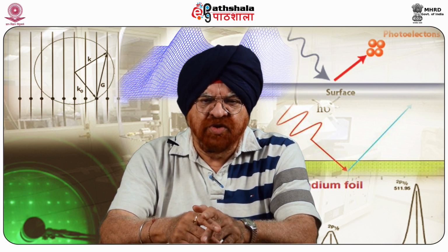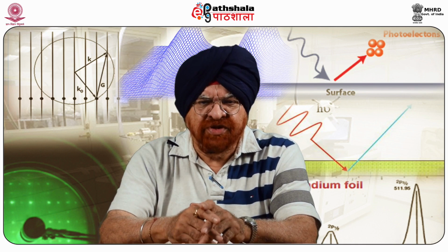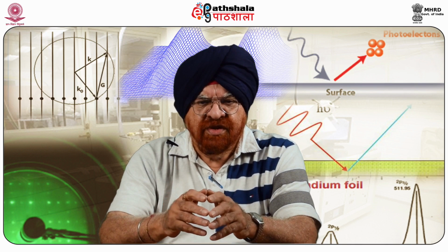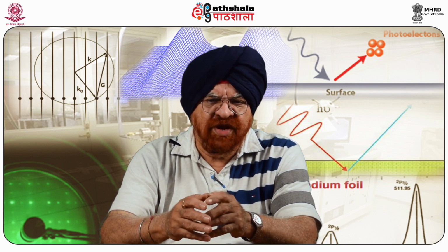Detection limits for most of the elements are in the parts per thousand range. That means 1000 ppm, parts per thousand range, as I said. Detection limits of parts per million are possible, but require special conditions in terms of concentration at the top surface or very long collection time, that's about 5 hours.